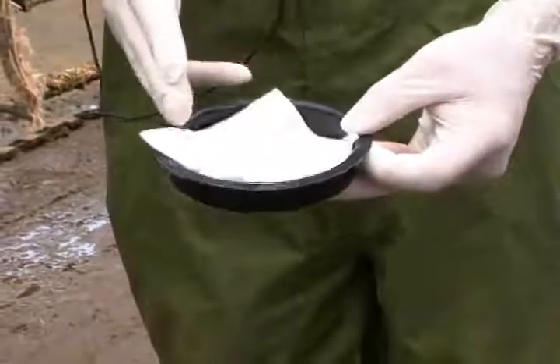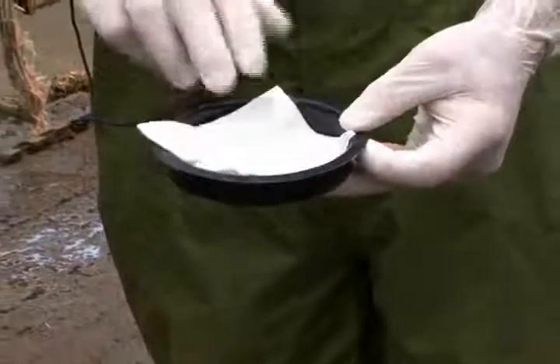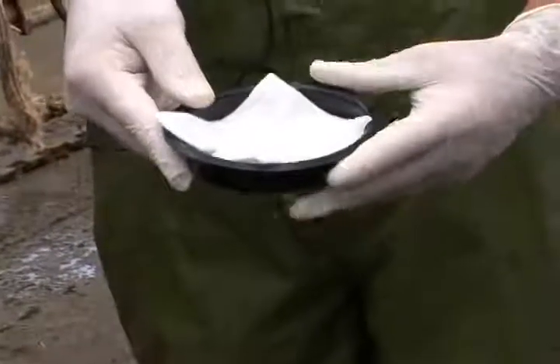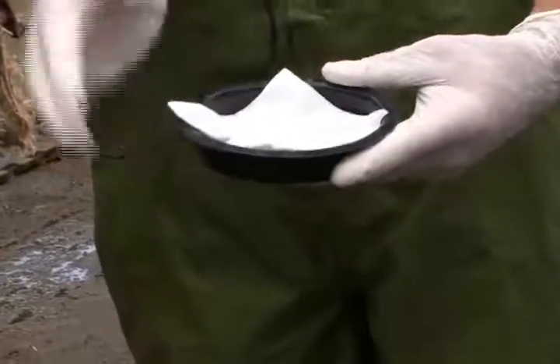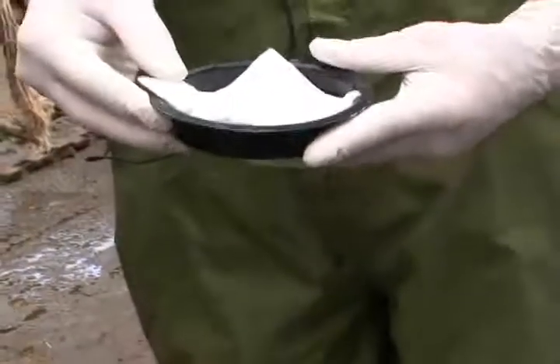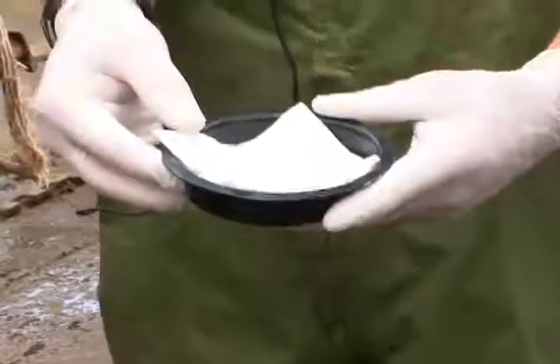The color change will go from white — like you see the background with this gauze — to a darker purple color, along the shades of purple, to the point where it can be a very strong violet purple color.